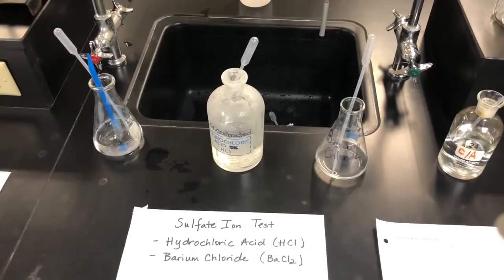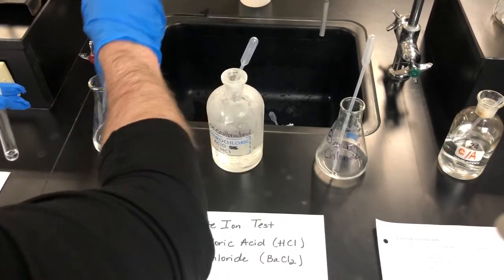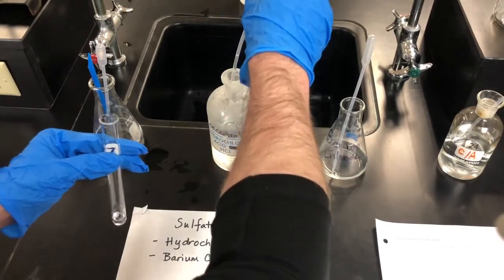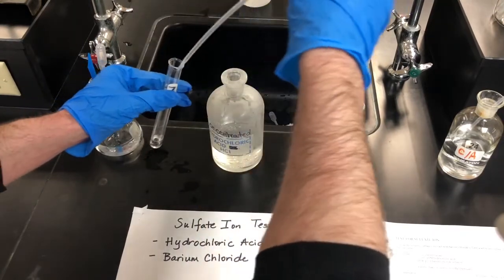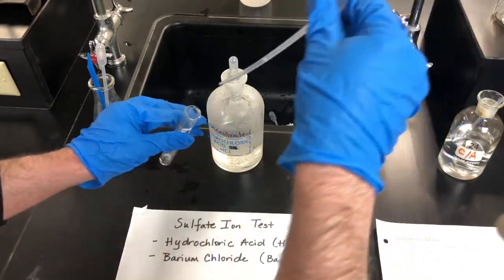Okay, so the next test we're going to be looking at is going to be the sulfate ion test. So what we're going to do is we're going to take a test tube and we're going to squirt some sodium sulfate in the test tube. It says 1 to 2 milliliters, so do a healthy squirt. We need 1 to 2 milliliters of 6 molar hydrochloric acid. So we use our hydrochloric acid, like that. And it says we're going to do 10 drops of barium chloride. So barium chloride is right here.